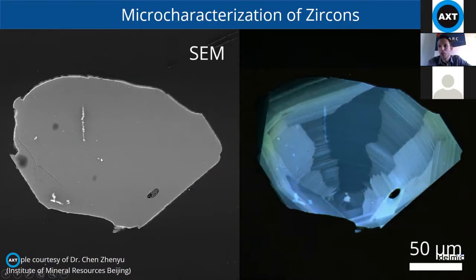You can see some detail in backscattering, but in cathodoluminescence, it's really apparent because while the zircons grow, the defect structure changes because the composition changes, or the number of defects increases, which is all related to the way these things are grown. And cathodoluminescence is really the best technique to visualize these zonation patterns inside of these zircons.